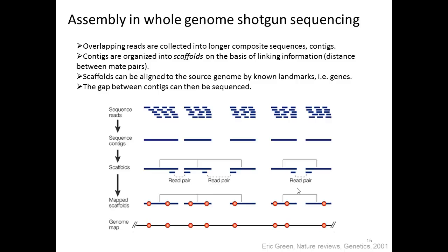These paired end reads could also be used to bridge contigs. If you have a lot of sequencing and then a gap, if you have one plasmid that showed similarity to one end of one contig and one end from another, you would immediately have an estimate for how big the gap is separating those two regions. And sometimes they were very large, so the big plasmids were quite helpful.